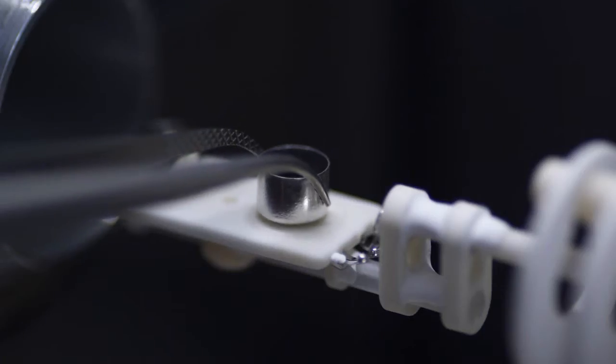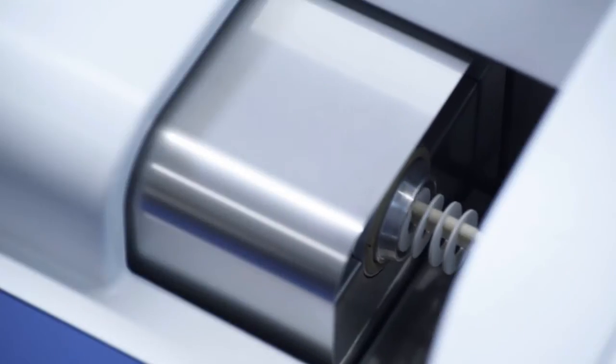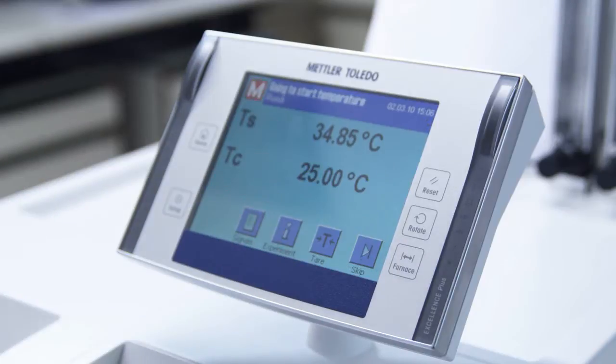The METTLER TOLEDO TGA DSC instruments ensure unbeatable accuracy. The heart of a TGA is the balance cell.